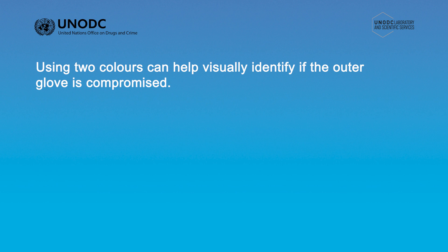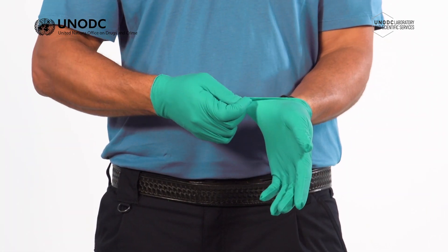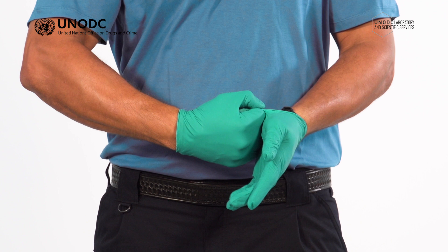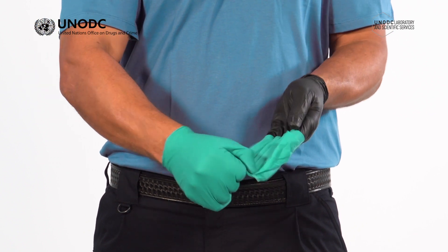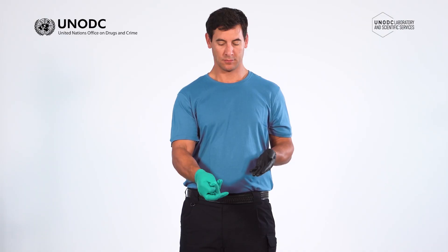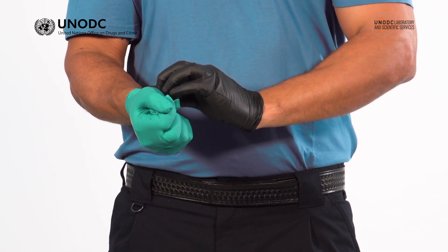If you are removing the outer gloves only, then you follow the same procedure as you did for removing the first glove only. Pinch and hold the outside of the first glove at the top of the palm just below the cuff and pull it away from the wrist. Curl your fingers under the outside of the glove to get a secure grip, then slowly pull the outer glove down to remove it, bunching the removed glove in the palm of your hand. The main difference with this method is that you don't try to slide your fingers under the cuff of the second glove.